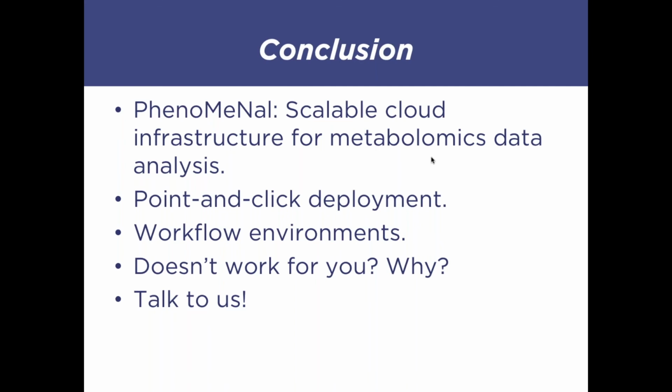Galaxy is an open source project, so you could even have your own flavor of Galaxy, right? It's just a component that we use in PhenoMeNal and that we customize so that it fits the needs of metabolomics data analysis. We also did a number of developments on top of Galaxy so that Galaxy could run on a cloud environment. That is a contribution of this project to the Galaxy community.